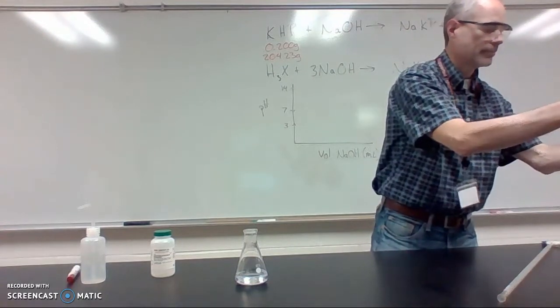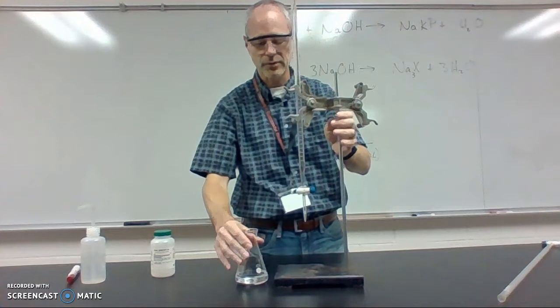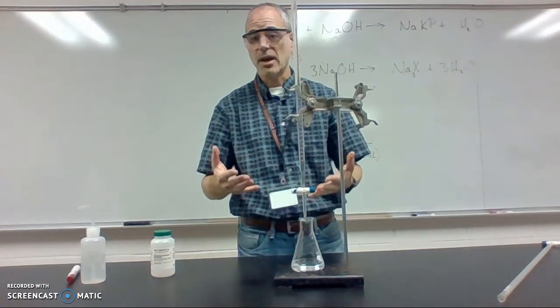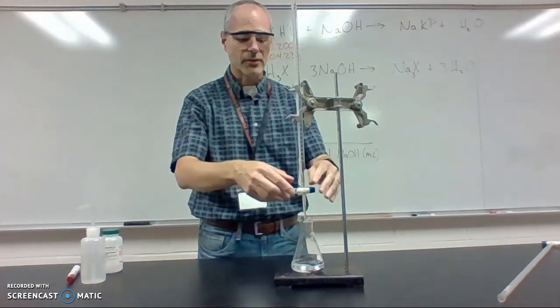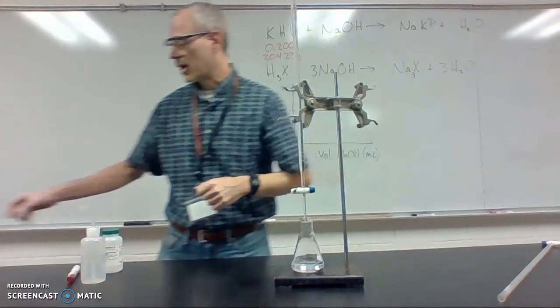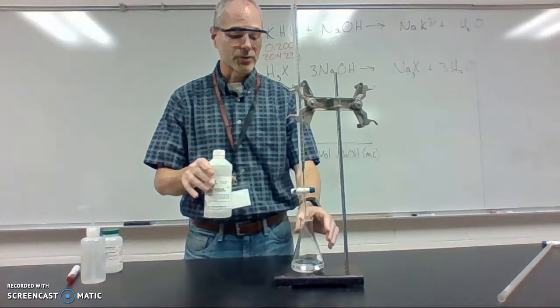So I have this set up right here, and we'll run through the titration to figure out how many milliliters of NaOH I would use for this particular mass of KHP. Now in running this, something very important you have to make sure of before you run it is that you have an indicator in there that shows a color change.